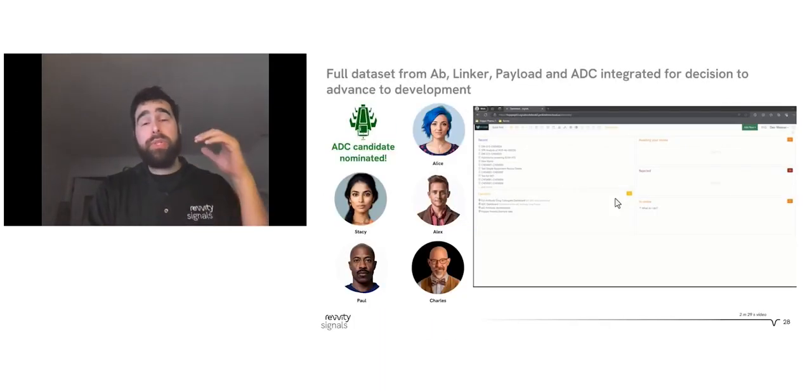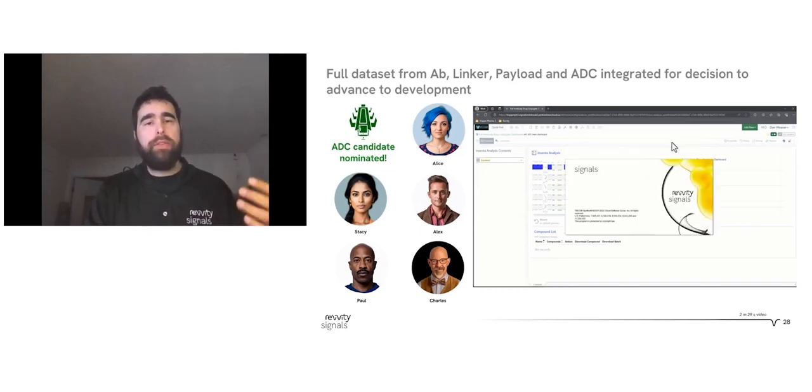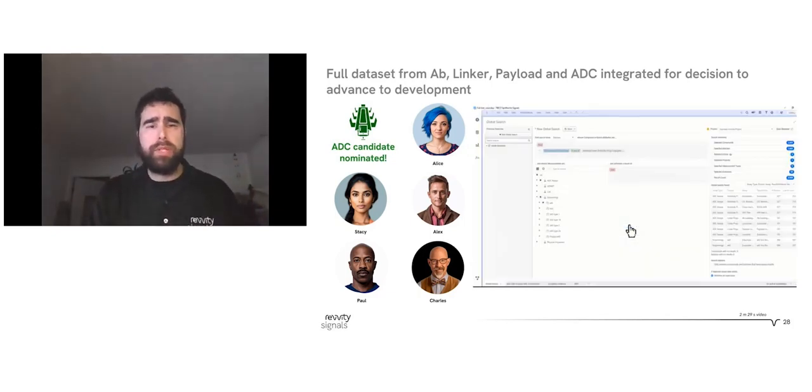Okay. So this brings us back to the beginning where I showed you the end dashboards. Here, not only do we have the antibody data, we have the small molecule linker, and all the sets are connected related to the ADC candidate. We have various dashboards of interest, a search where we can select various aspects of interest and deep dive into this data. So once the search is performed, we can observe a dashboard that looks like the one I showed you in the beginning where all the data is connected.